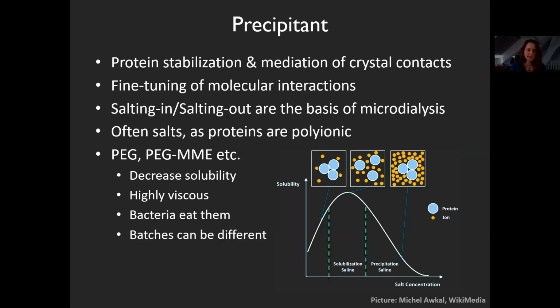You're going to see that in a video later. Also, bacteria like to eat them. I cannot repeat this enough. Bacteria like to eat them. Mold also does. So, bacteria will settle in your crystallization plate. Better wear gloves when you dispense that stuff. And you can put some stuff in to at least stop mold and bacteria from growing.